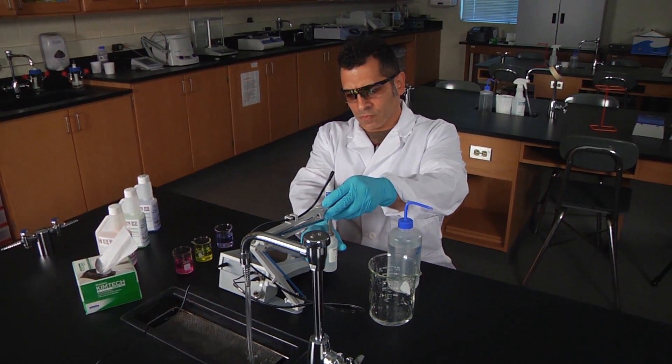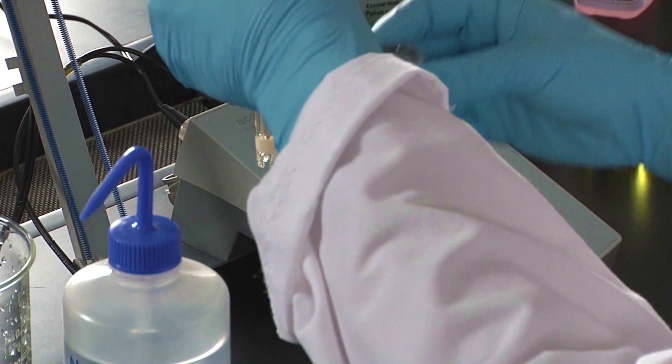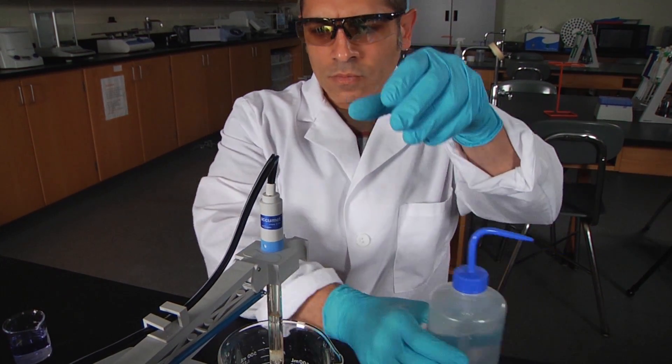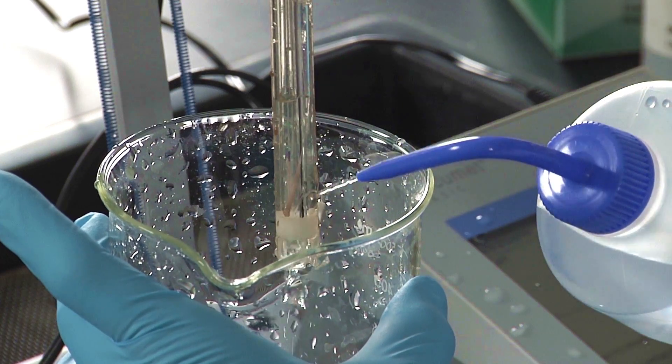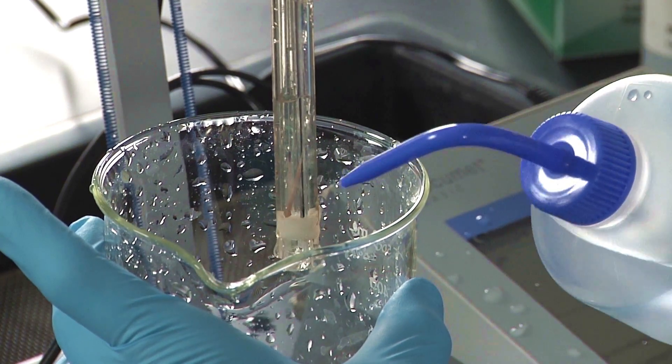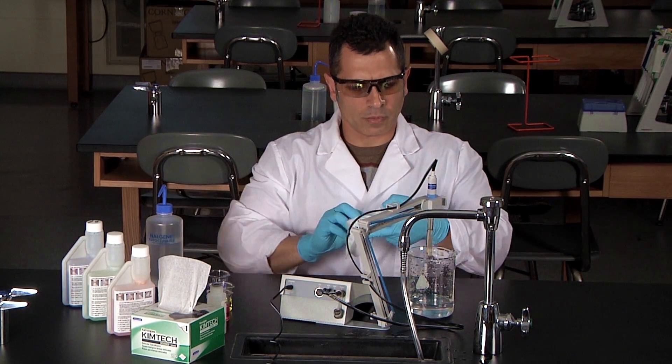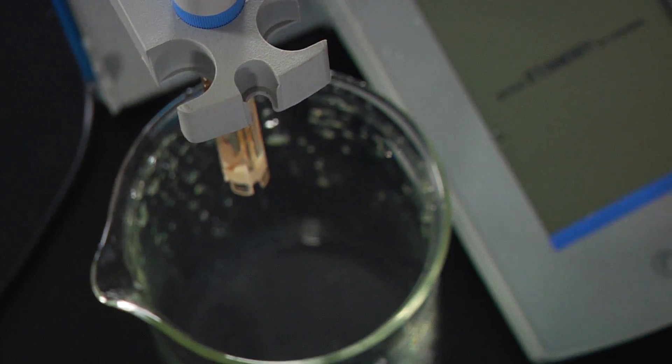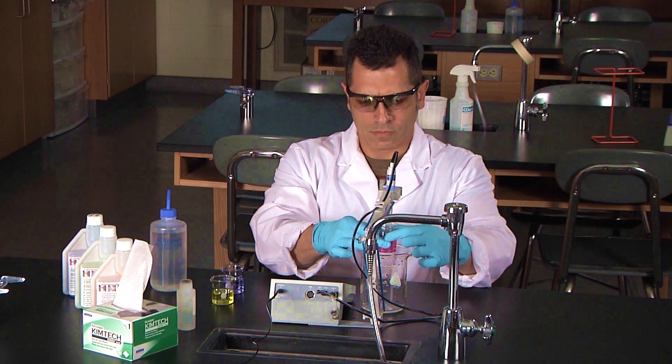Remove the probe from the storage solution and rinse with deionized water. Carefully blot the bottom of the glass bulb with a kim wipe. Next, place the probe into the beaker containing the 4.0 standard buffer solution.